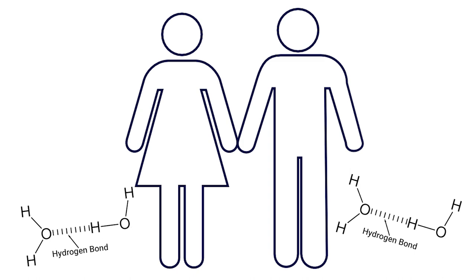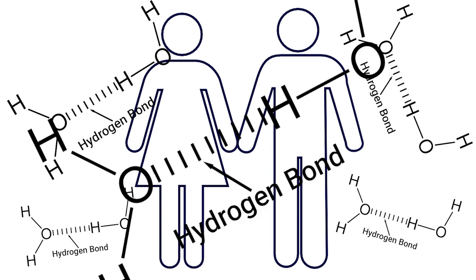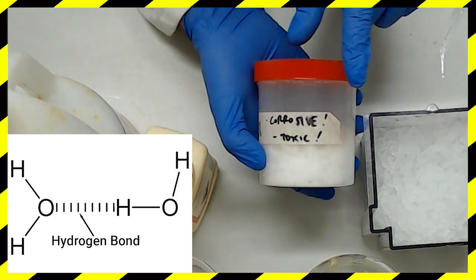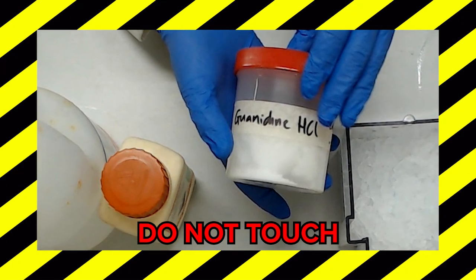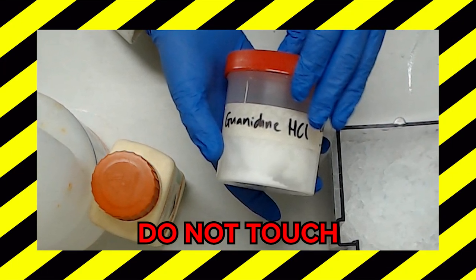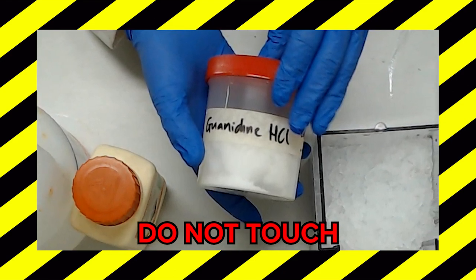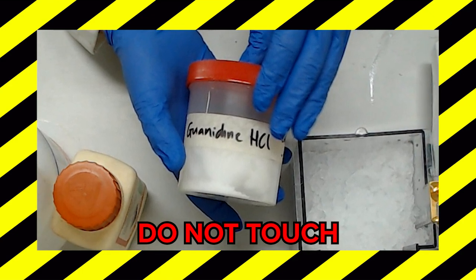Did you know that a lot of your day-to-day bodily functions rely on hydrogen bonds being able to function? Needless to say, spilling a chaotropic salt or solution on your skin will be a seriously unpleasant experience. Reading the MSDS for guanidine hydrochloride explains that exposure to the skin, eyes or lungs will lead to acute toxicity, with the mystifyingly spooky stipulation that the target organs are the bone marrow and nerves.